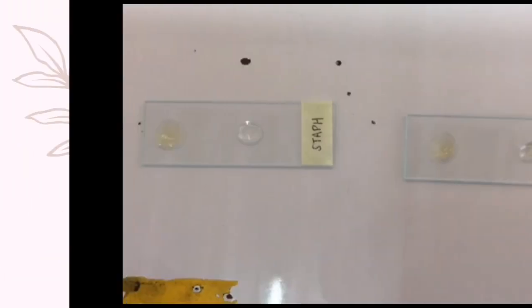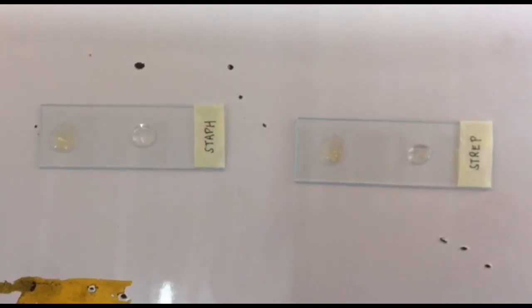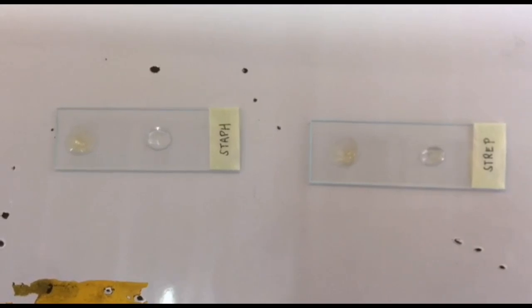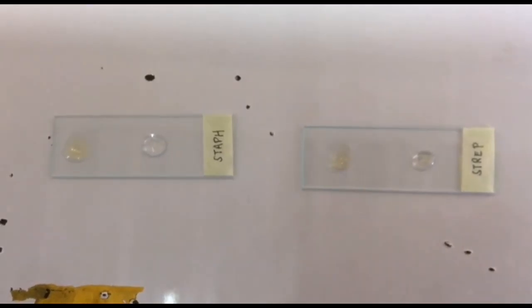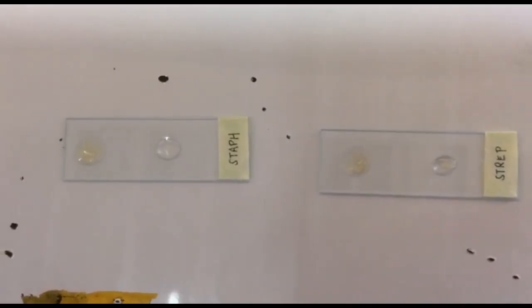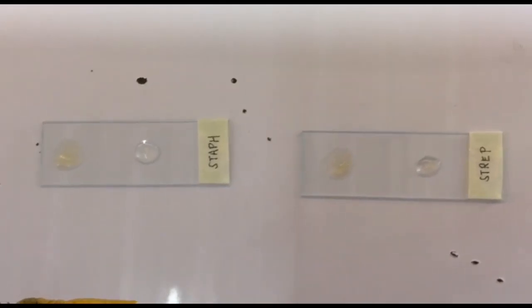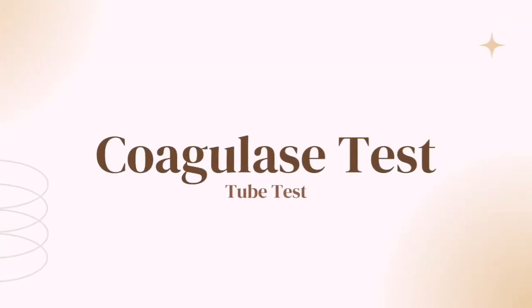Here are the results. For Staphylococcus, it is observed that the drop of human plasma has created clumps, which can be reported as coagulase positive, considering that the drop of normal saline solution still looks smooth and milky white. Whereas for Streptococcus, there is no clot formation in the drop of human plasma, which can be reported as coagulase negative. Also considering that the drop of normal saline solution still looks smooth and milky white. Let us now move forward to the coagulase tube test.